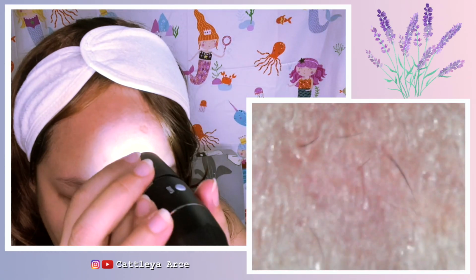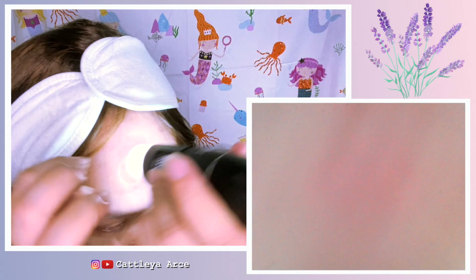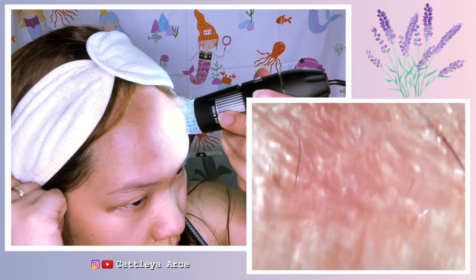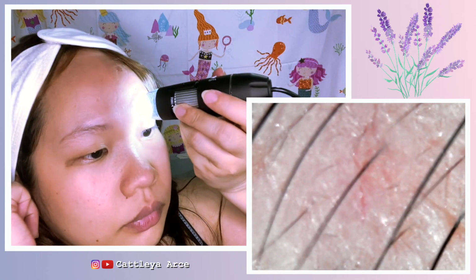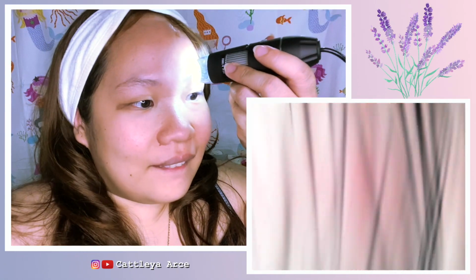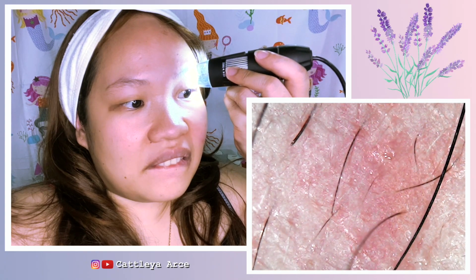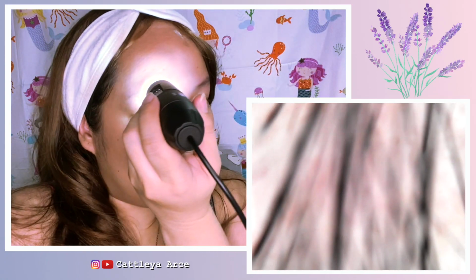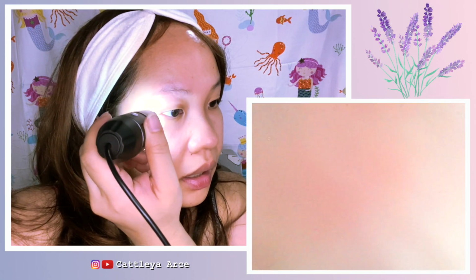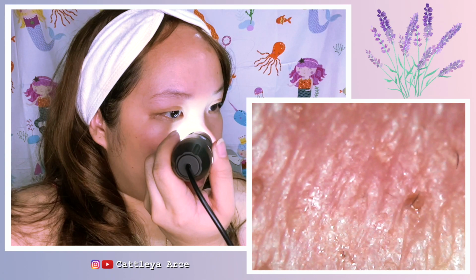So let's move to our forehead. My forehead doesn't really have any bumps. It looks very different. Okay, now we move to our eyebrows. It's really amazing to see this under the microscope. Maybe next time I'll microscope my scalp on my head, my hair. So this is around my eyes. Nothing exciting on this part.